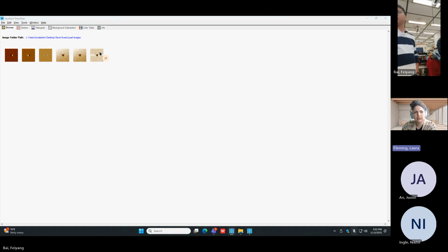The topographical is the Z piezo data as it goes up and down as it scans the sample surface and tries to keep that transducer in contact at 2 micronewtons. The gradient image is often called the error image. That is from the transducer, and that is the variance in force around that 2 micronewton set point.